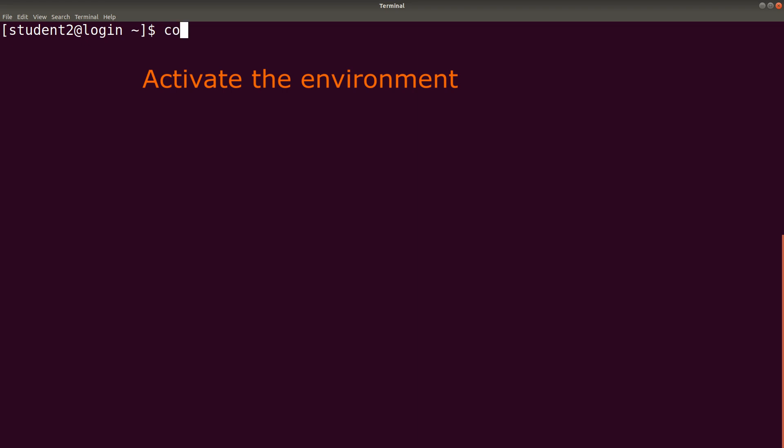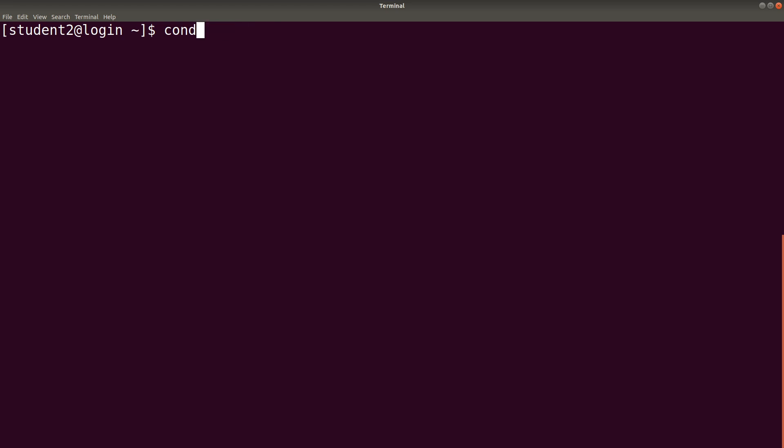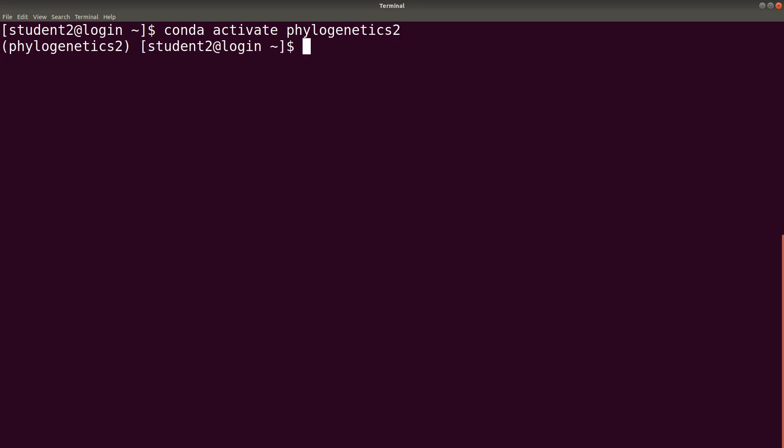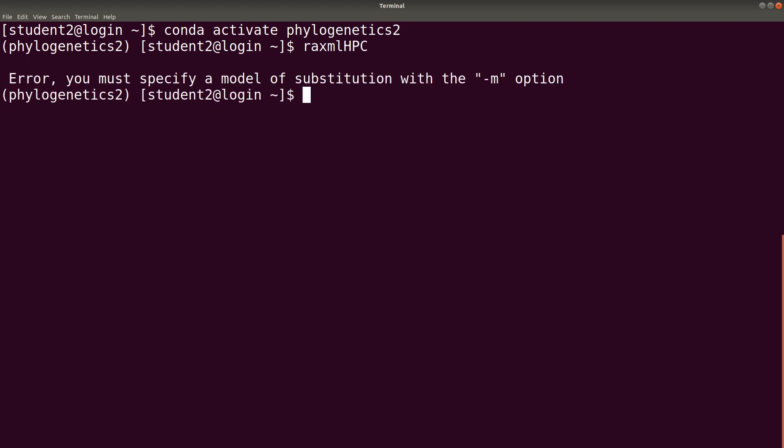We say conda activate phylogenetics2. From here we just issue raxmlhpc. And we are done.